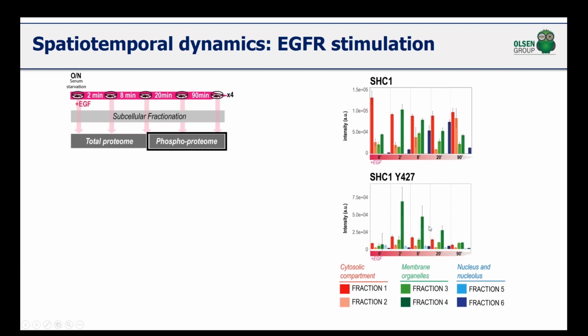So this is a very nice way to directly look at the spatial-temporal dynamics of EGF signaling.